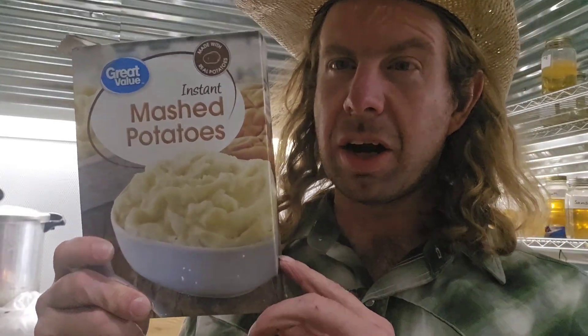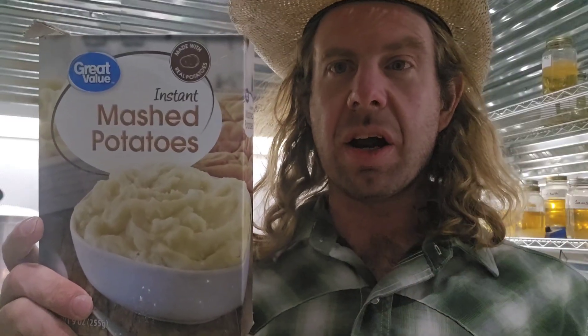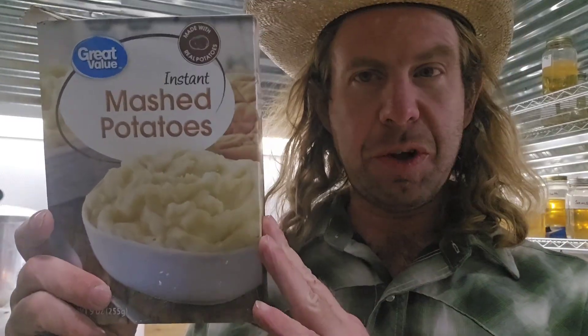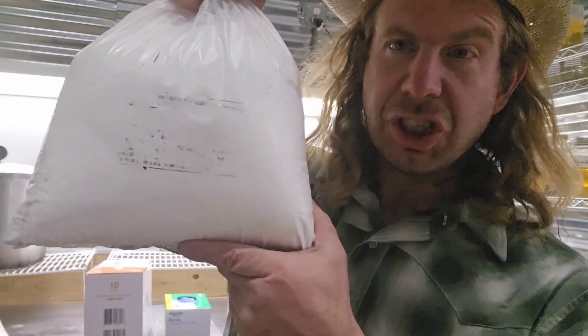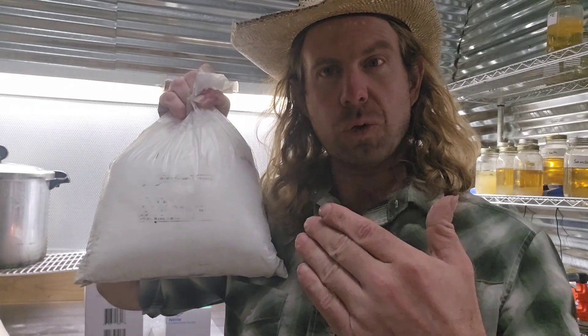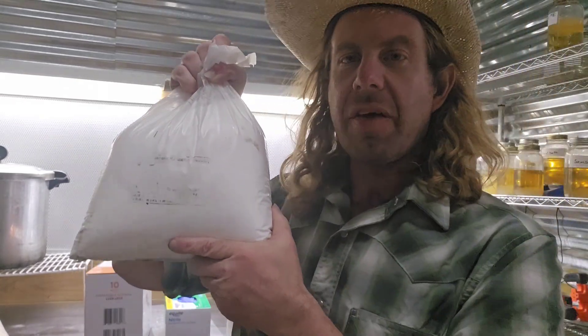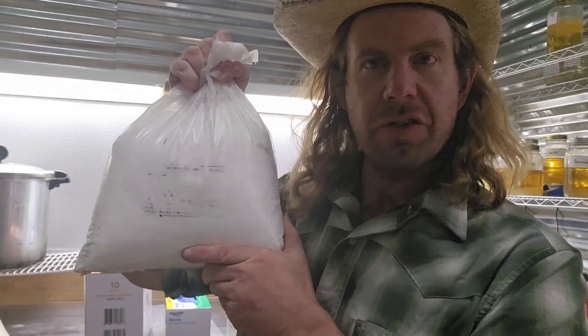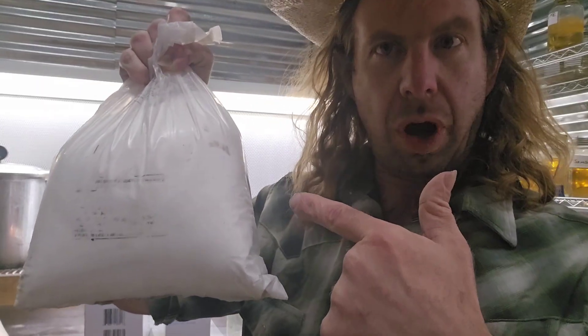Number six: potato flakes — these are dehydrated potato flakes. This is another ingredient for your agar plates or your potato dextrose agar. Number seven: corn sugar or dextrose. When I'm talking about using dextrose for liquid culture or for agar, this is it right here — I buy it by the 10-pound bag. You'll either call this dextrose or corn sugar, but number seven is dextrose.